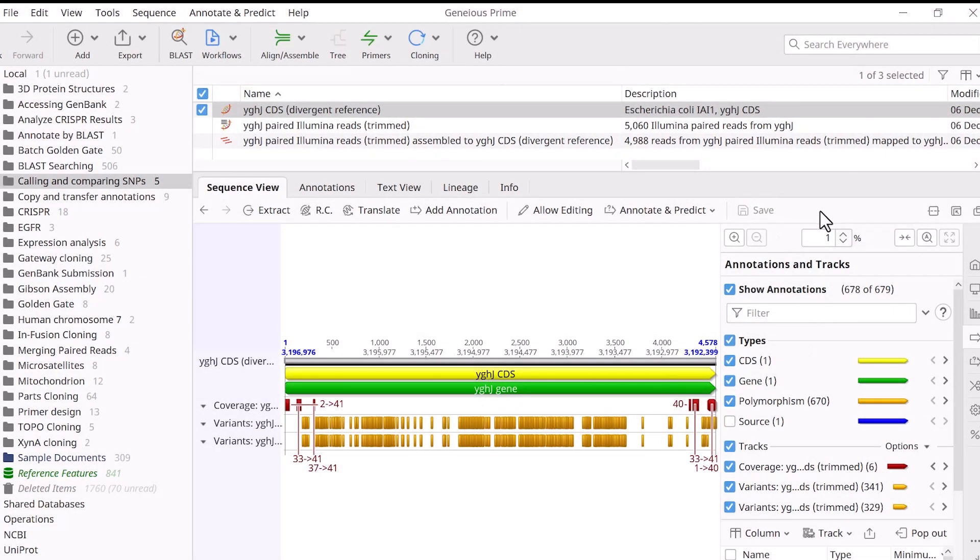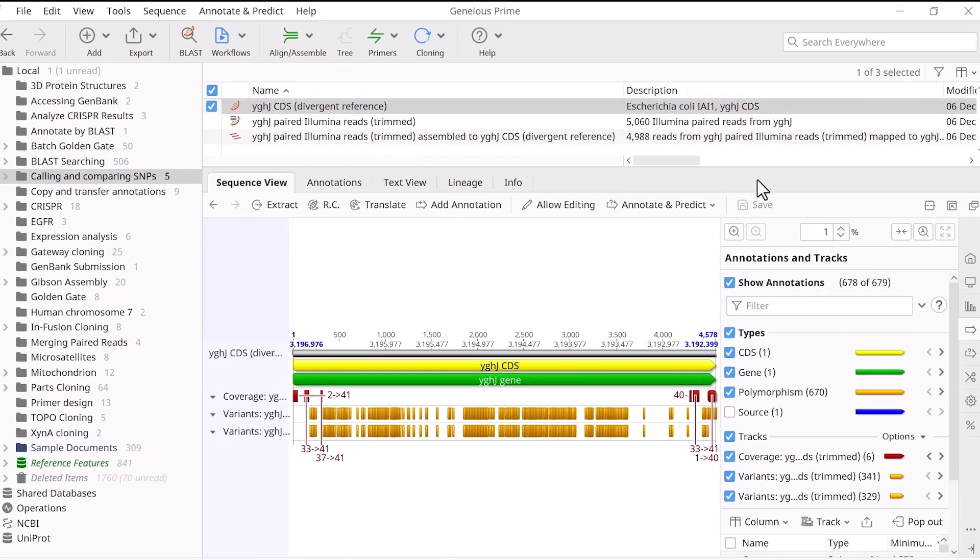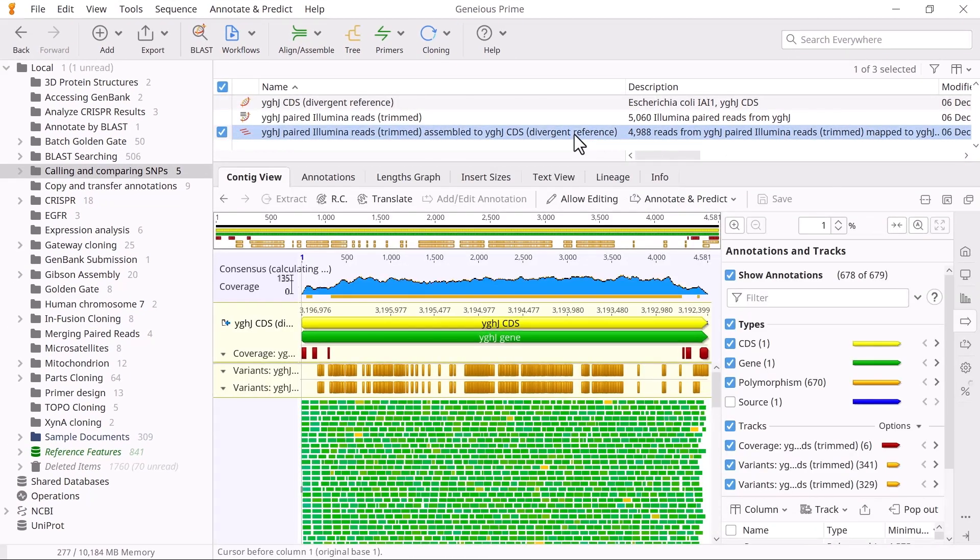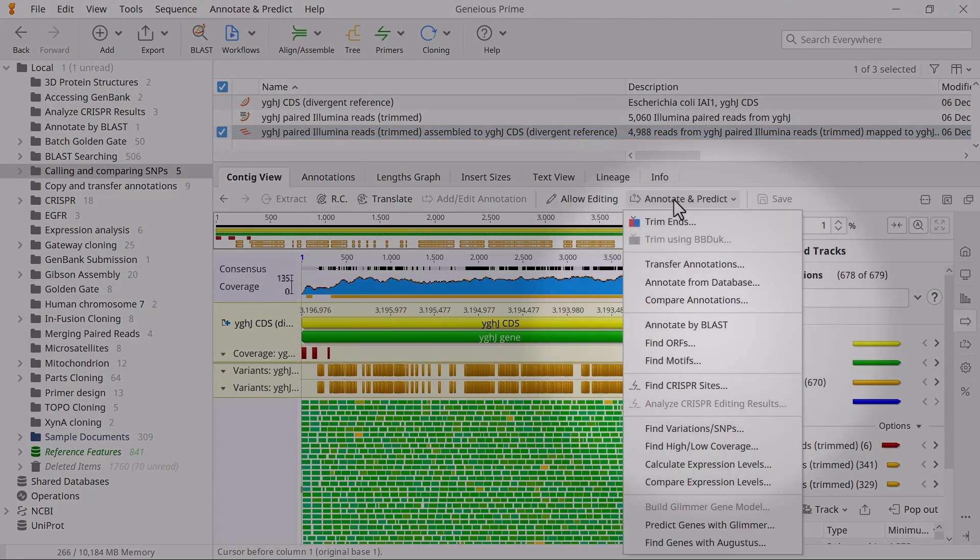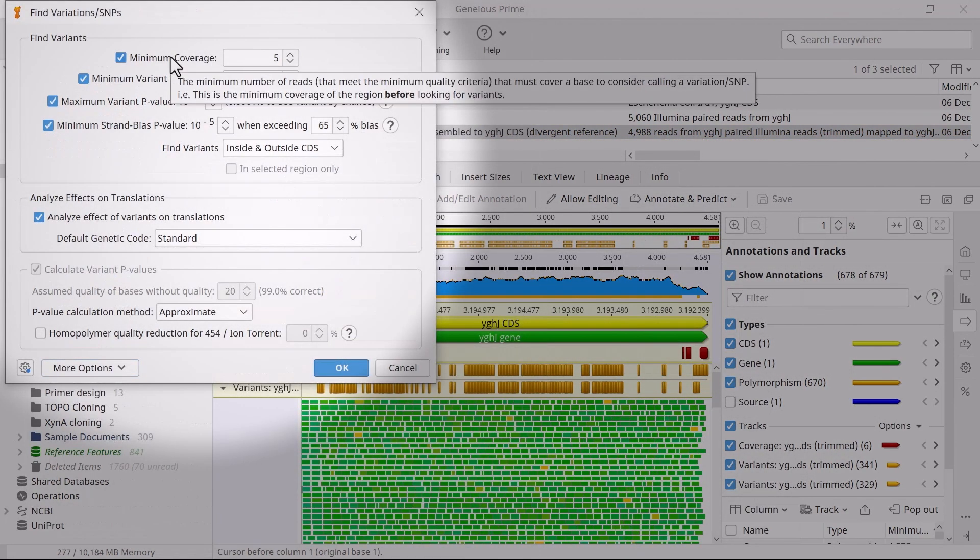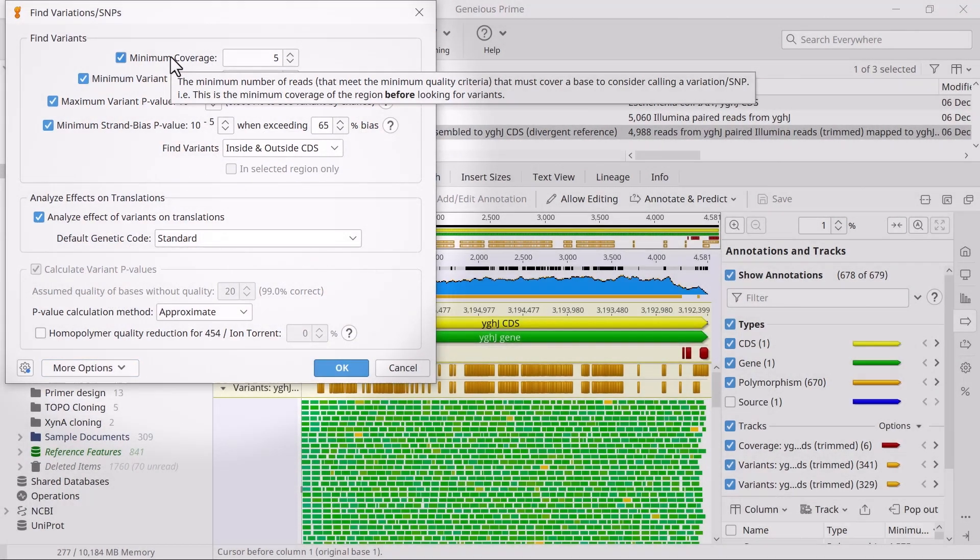Don't forget to save your changes. You can also filter out low coverage SNPs automatically by using the Find Variations/SNPs tool and entering a minimum coverage value at the top of the window. And that's how you can compare SNP annotations in Geneious Prime.